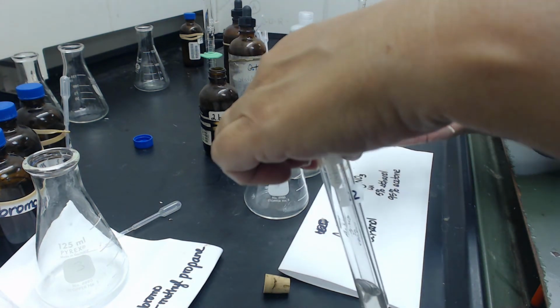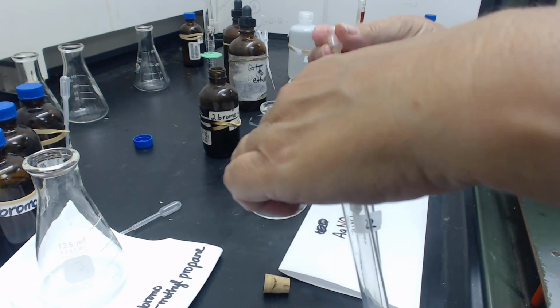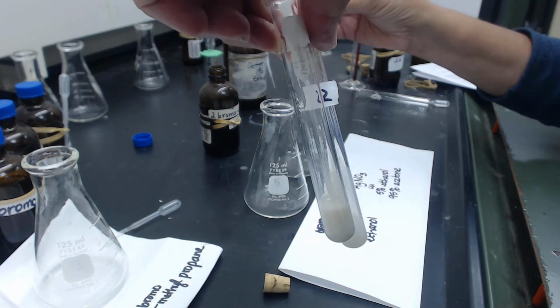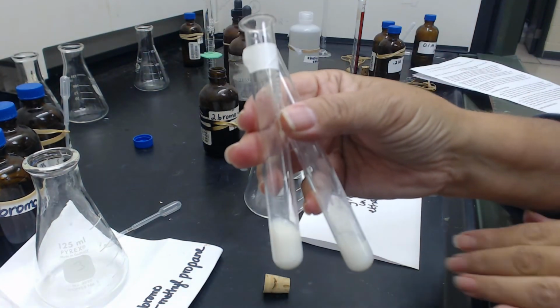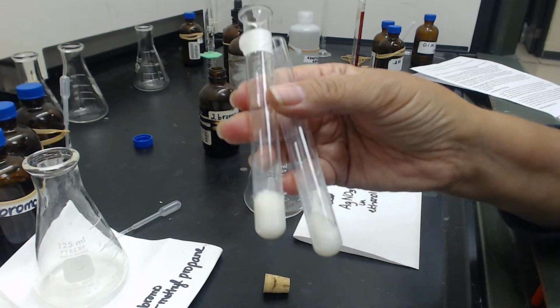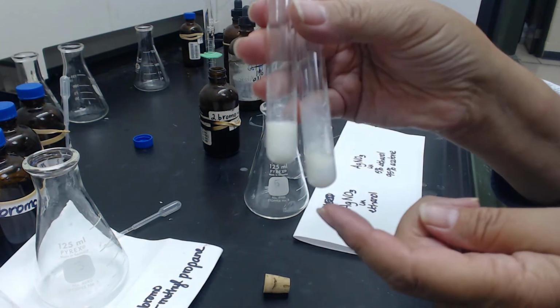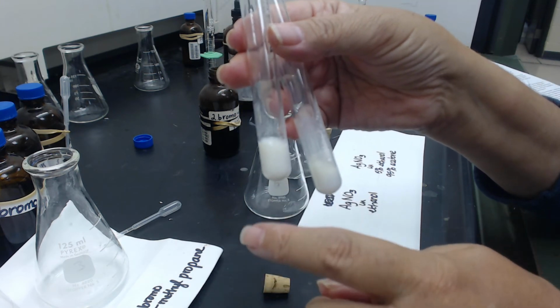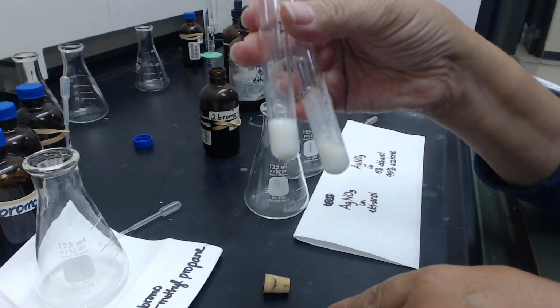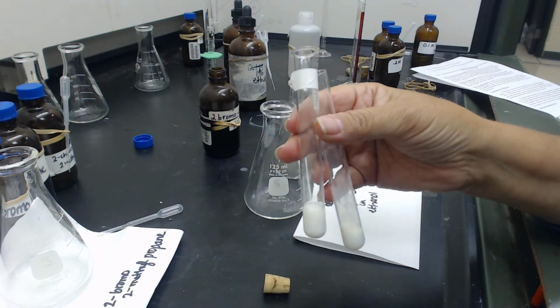Let's see if I can put that here. They both go pretty quickly. However, the one on the left, which is the ethanol, is definitely darker and quite a bit more precipitate has formed. So the ethanol is definitely a better solvent than the acetone for this.